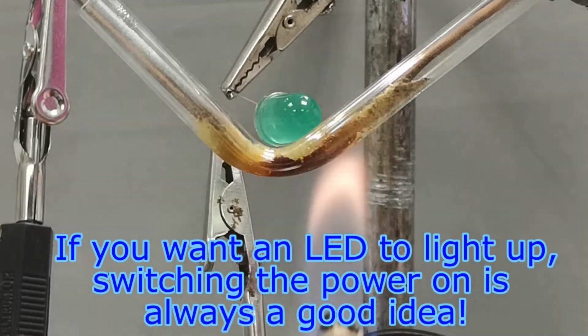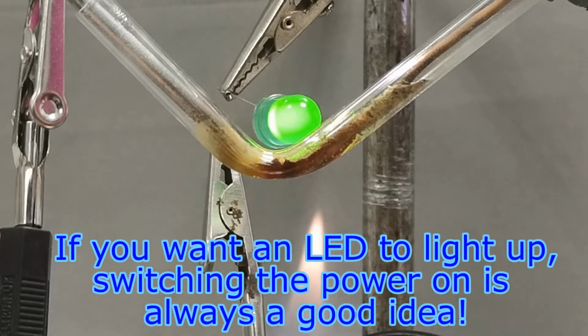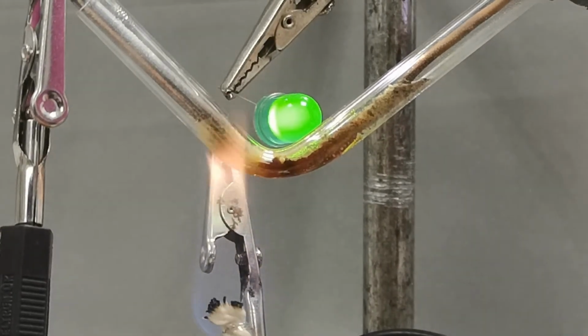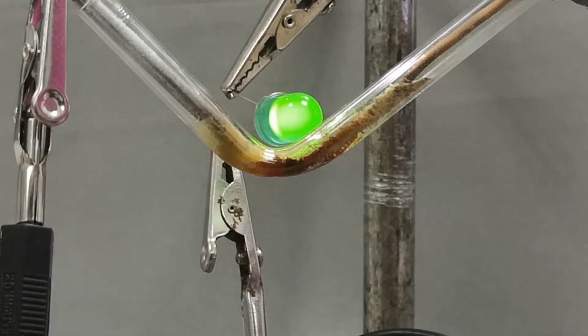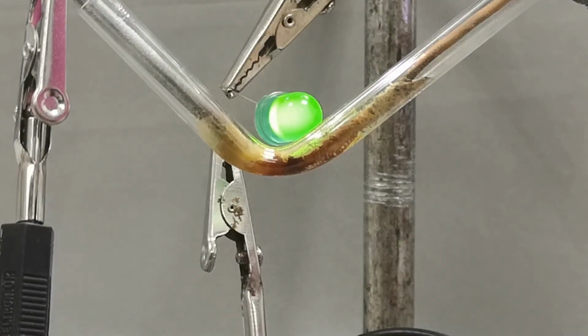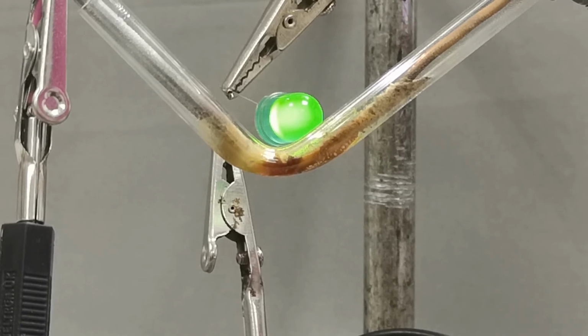As you can see, once the power supply was actually turned on, the LED glows brightly. When the heat is removed, however, the lead bromide cools and you can see that the LED slowly fades and then goes out. As the lead bromide solidifies, the ions can no longer move and so no current can now flow.